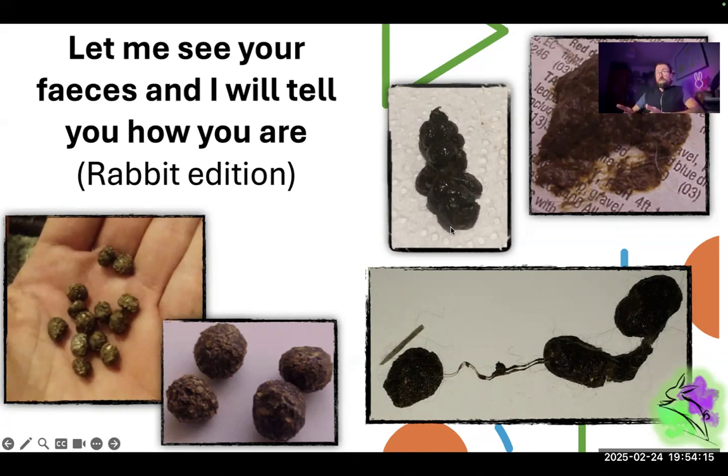You shouldn't be able to see it because the rabbits have to eat it straight away. So you also have to identify why your rabbit is not eating the cecotroph, but again, this is not the right webinar to speak about that. Or we can see feces like a long chain, because the rabbit is grooming himself, or if living together, when they are grooming each other, they can swallow a lot of fur, and the feces can resemble a quite long chain.